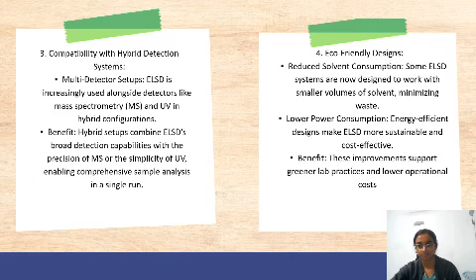Fourth is eco-friendly design. Reduced solvent consumption: some ELSD systems are now designed to work with smaller volumes of solvent, minimizing waste. Lower power consumption: energy efficient design makes ELSD more sustainable and cost effective. It is beneficial in that it supports greener lab practices and lower operational cost.